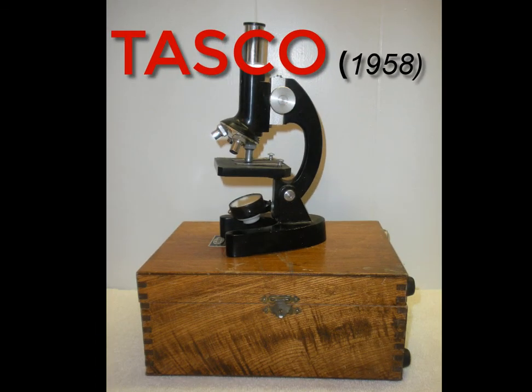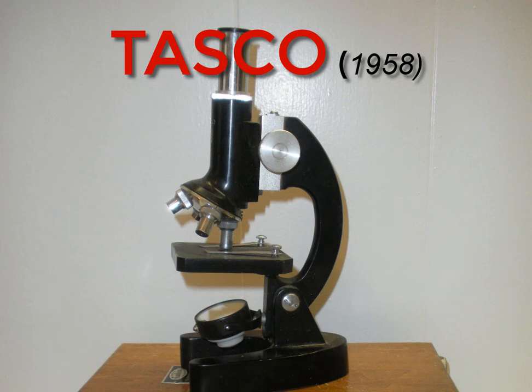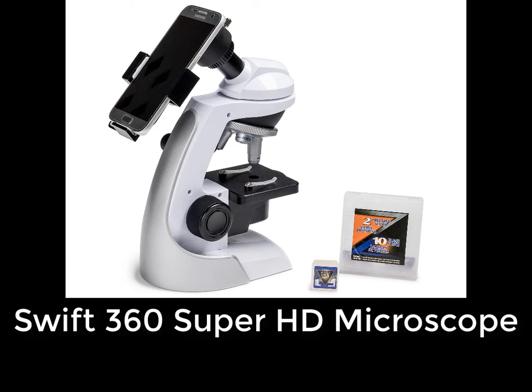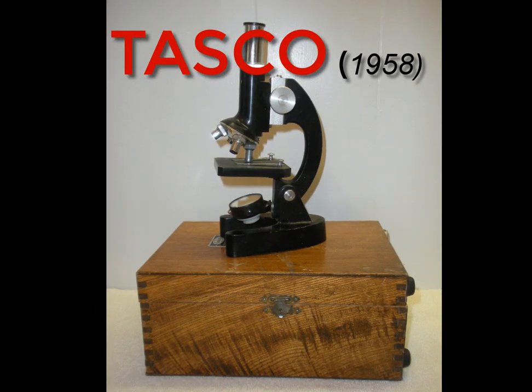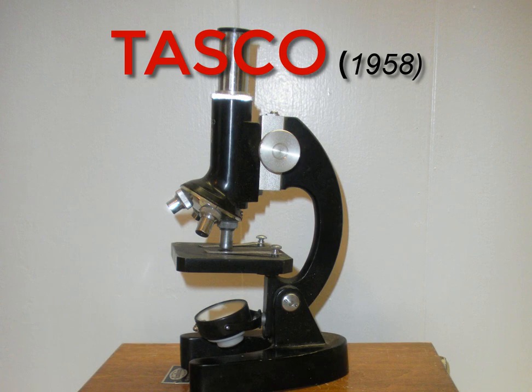Even though my own initial scope, given to me by my parents, wasn't the greatest, that little Tasco has been with me my entire life and started me on an adventure that I've enjoyed immensely for decades. It is my hope that many children grow to adulthood with that same appreciation for their first microscope. I hope this review has been helpful as you try to choose a microscope for your child or grandchild. If my experience is any guide, you will be fondly remembered long after you're gone. My mother and father gave me many wonderful gifts, but this little Tasco has been among my most precious.